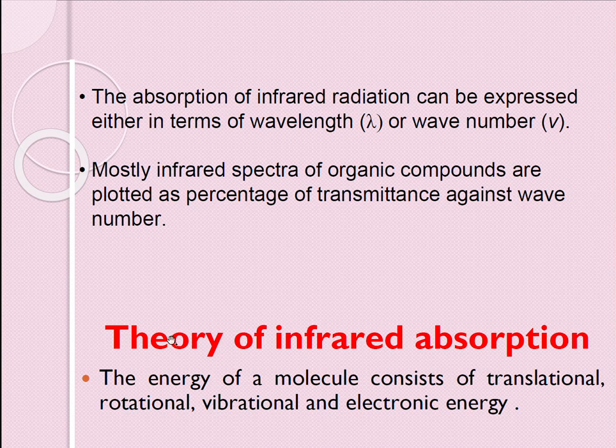You already know that in spectrophotometry, compounds receive some radiation, and after that it absorbs some radiation, and some of it is transmitted. And by utilizing the transmitted energy, we usually measure the nature of the solute or analyte.